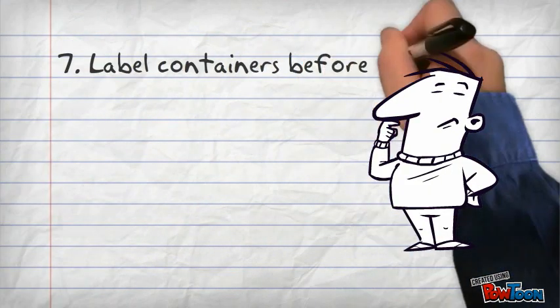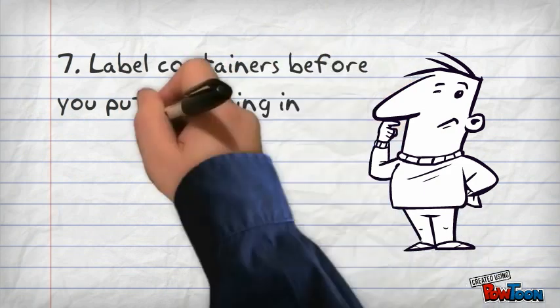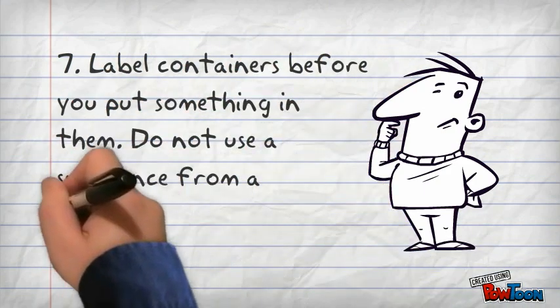Rule number seven. Label containers before you put something in them. Do not use a substance from a container that is not labeled.